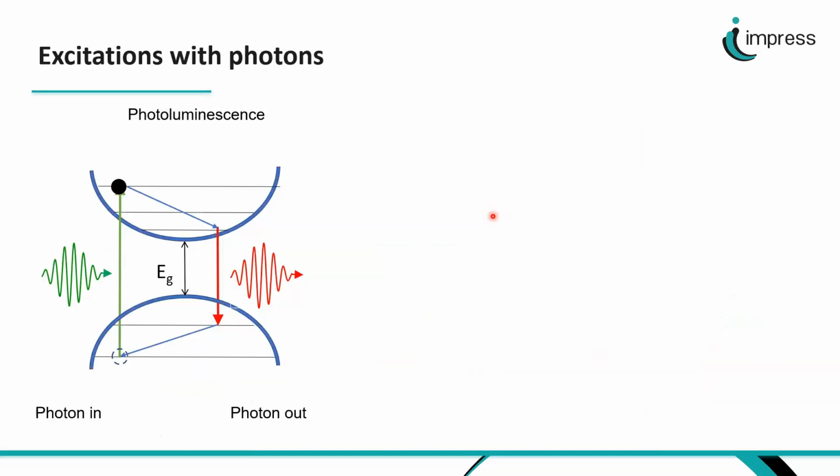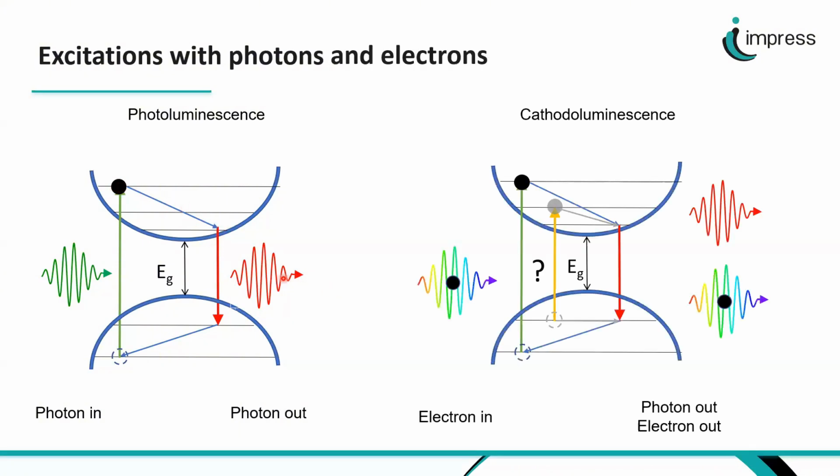So typically in an optical experiment with photons, we can excite a given transition, maybe higher than the band gap of the material. This transition can relax and eventually decay into a photon. The same process is possible with electrons. An incoming electron that is transmitted through the sample can create an excitation that will eventually decay into a photon. However, because we cannot control the excitation energy, another transition might be excited for a second electron that passes by, and we want to understand if the second transition also leads to light emission, and with which probability compared to the first one.